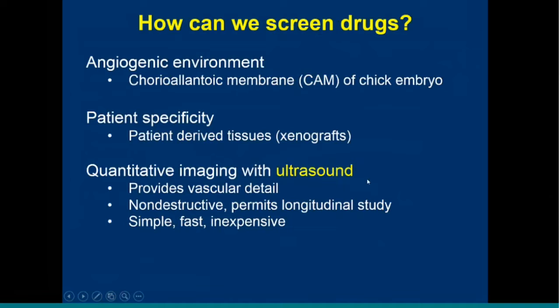We've tested a number of other modalities, including OCT and bioluminescence, and it's pretty unequivocal that ultrasound is really the modality you want to be using for this. It provides vascular detail through the entire volume. It's non-destructive, allowing longitudinal study. It's simple to implement in the CAM, and it's fast and inexpensive.